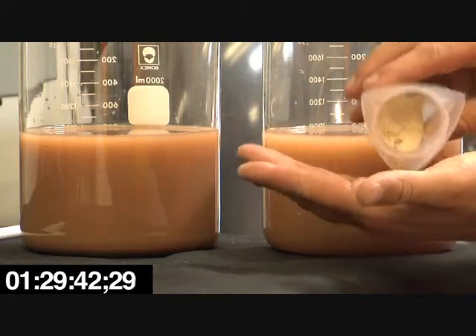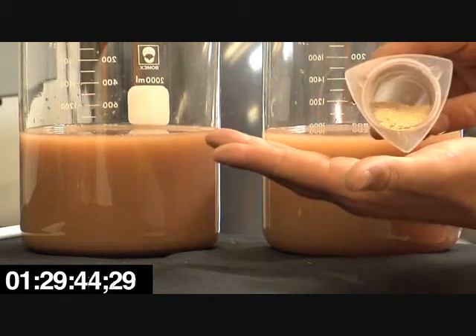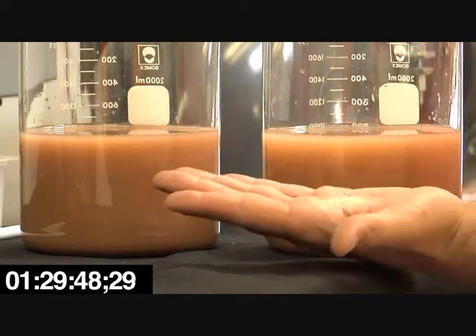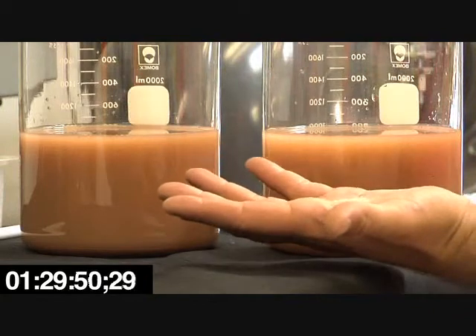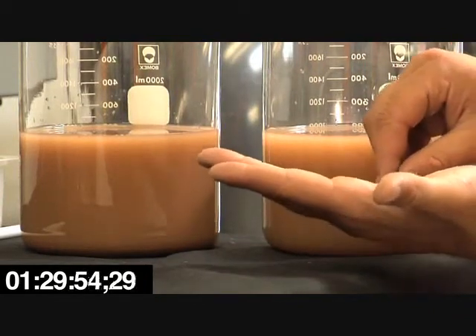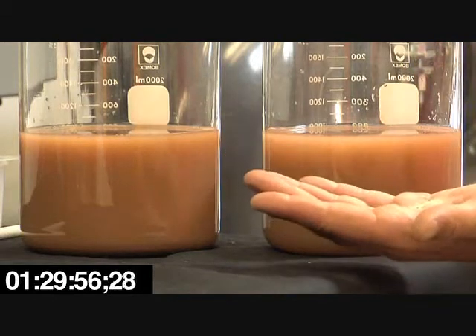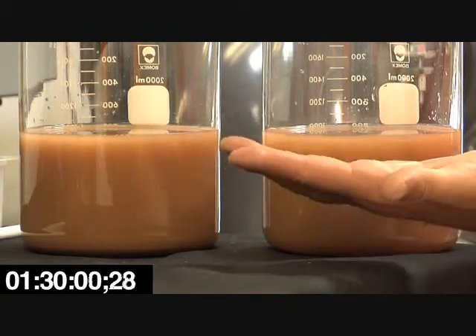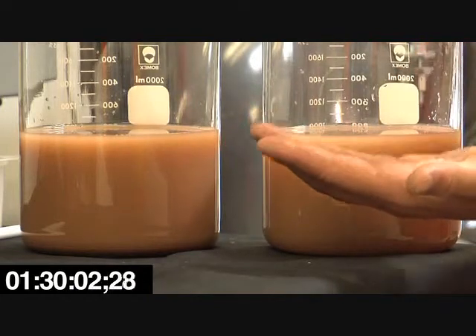I'm going to start out by using some of this dry chitosan lactate. We administer this through a cartridge — it's kind of a sock-like cartridge that the water will flow through. I'm just going to take a little pinch of this, and this is actually what we're pre-treating with. So I'm just going to take a little more.